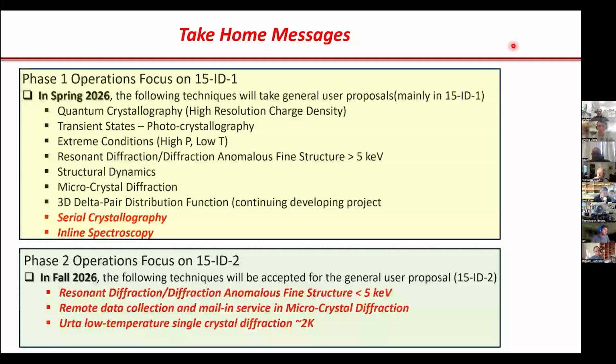I cannot tell you right now, because I don't have any beam yet, but we can try to get it. And in your case, you see them decompose quickly. Is it because of air sensitivity or radiation damage? It's beam damage.